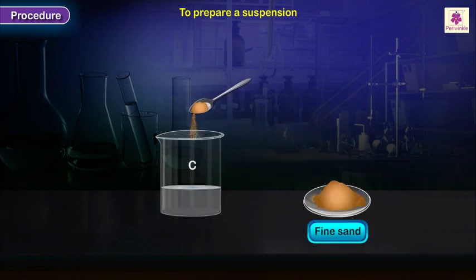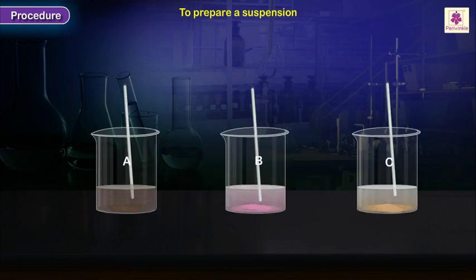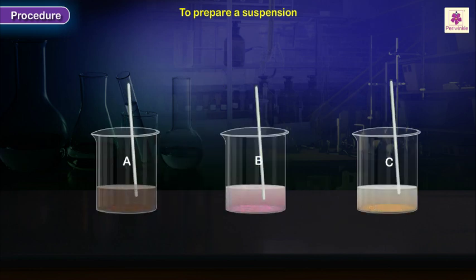Add fine sand in beaker C. Gently stir the three mixtures with clean glass rods.